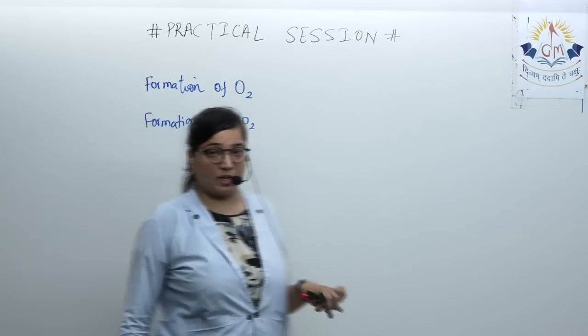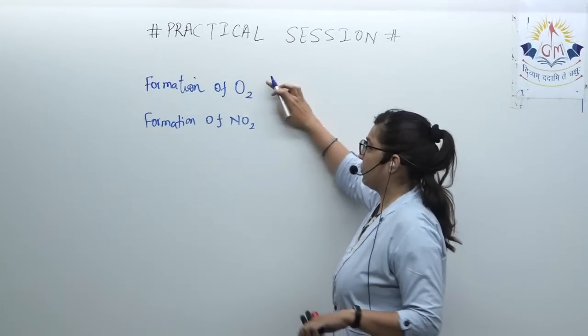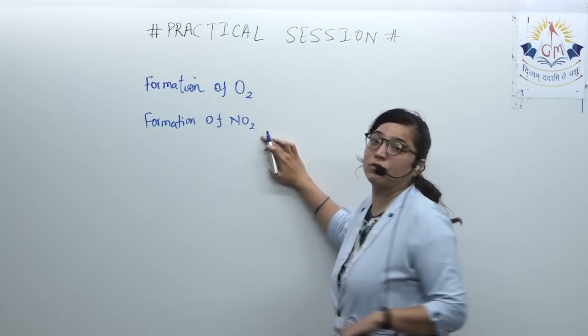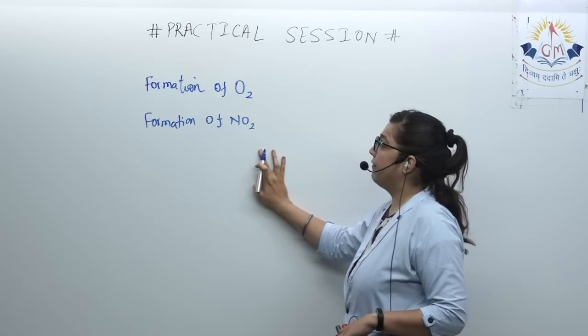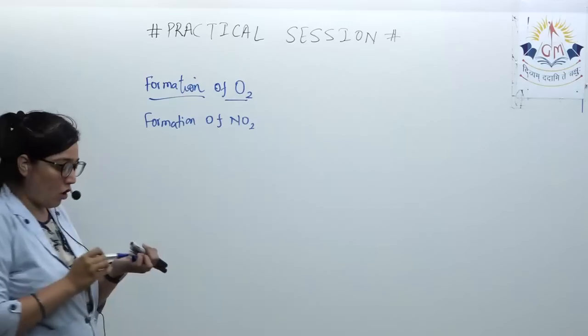We are going to see the formation of these two gases, oxygen and nitrogen dioxide. First, let us understand about the formation of oxygen.